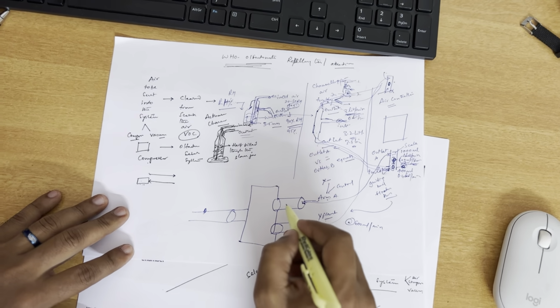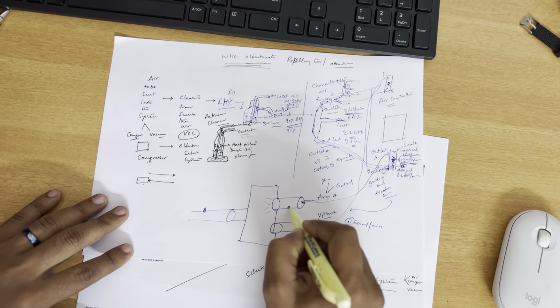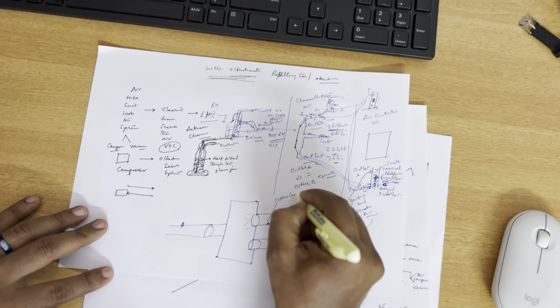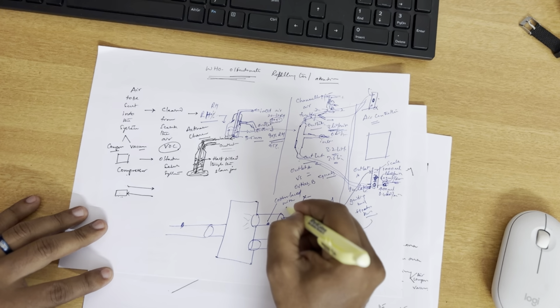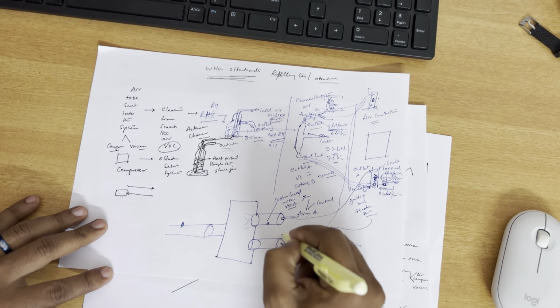Now when these air fumes get mixed, as we discussed, you have placed cotton laced with maybe volatile compound A or any chemical B here.